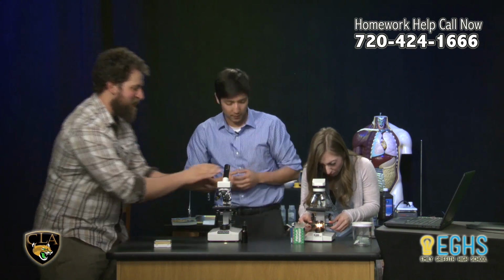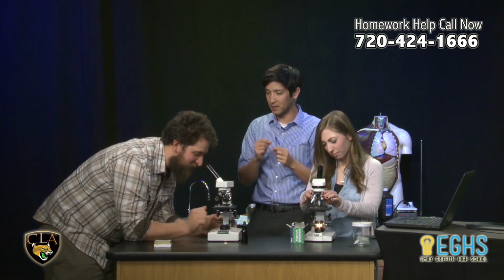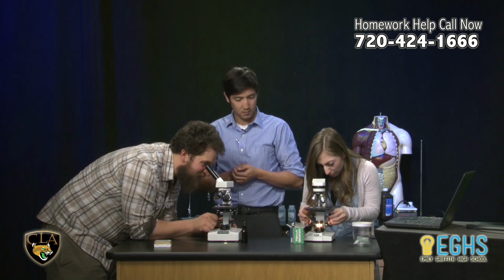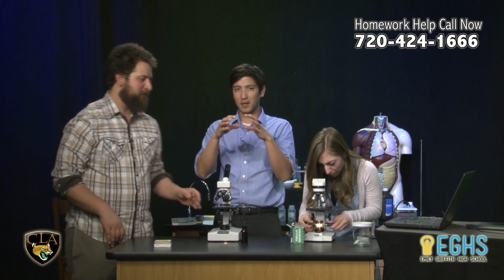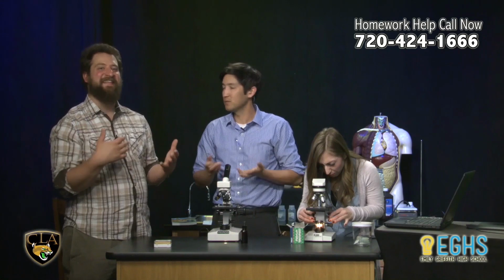Exactly. Can I just take a look and see where we're at with yours? So we have some dark blue dots. Oh yeah, those are the dark cells. Blue dots are your cells. That is perfect. All right. Fantastic. And we're not going to take a picture at the lowest zoom because it's just not that interesting yet. It literally just looks like a blue spill with some darker blue dots on it right now. Exactly.